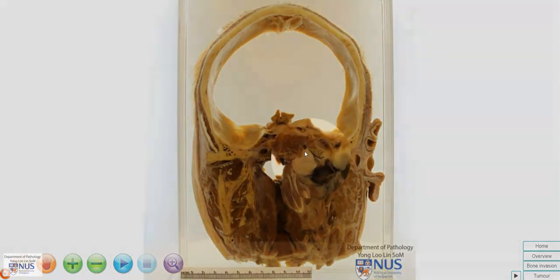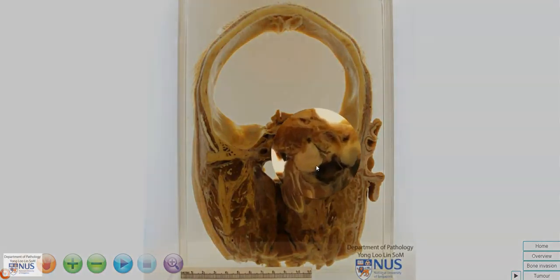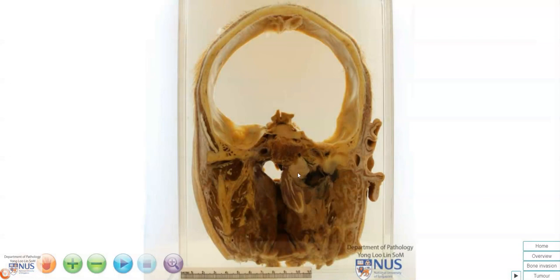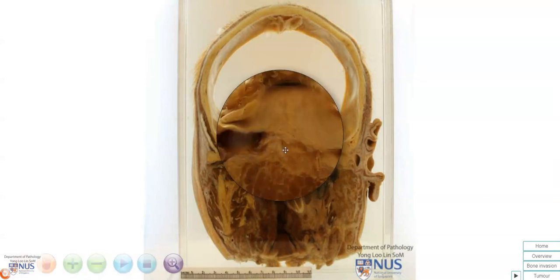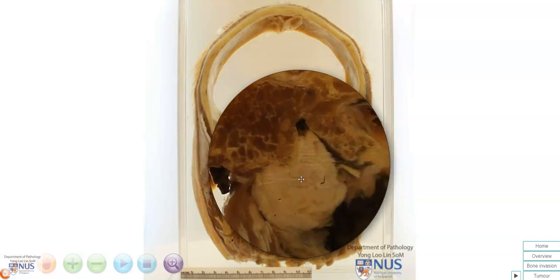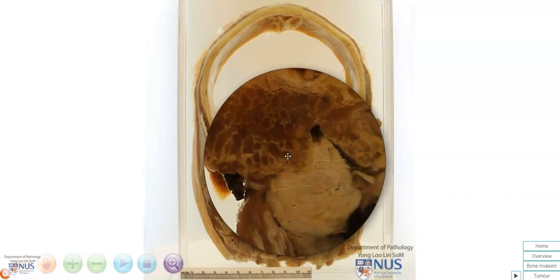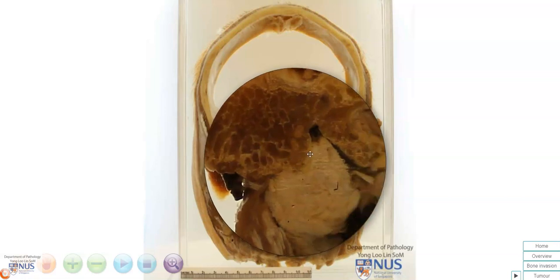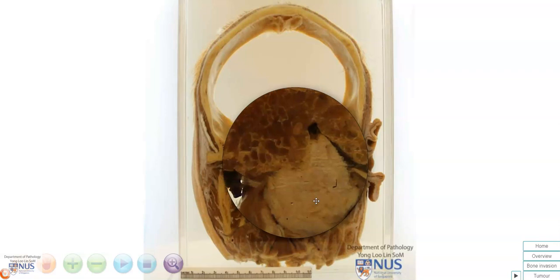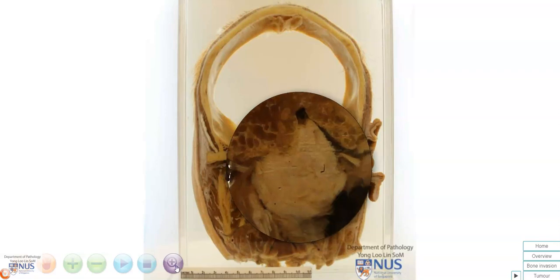Posteriorly, we can see that there is a pale, tan, fleshy mass in the region of the right nasopharynx. And it is partially eroding into the adjacent sphenoid bone. So this is the gross appearance of nasopharyngeal carcinoma.